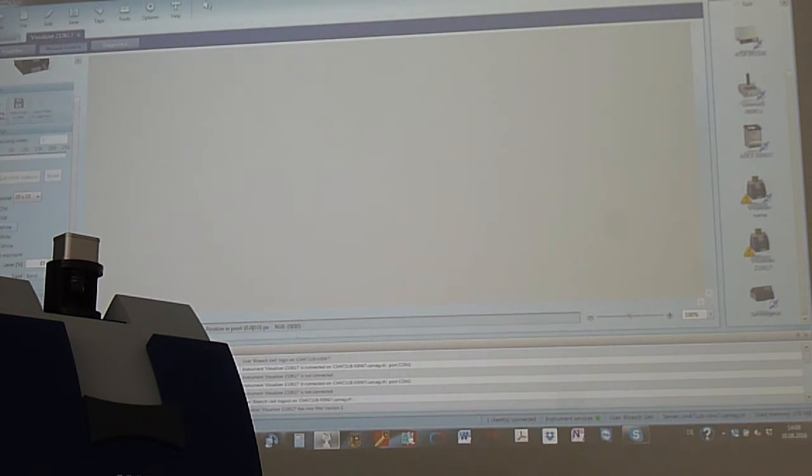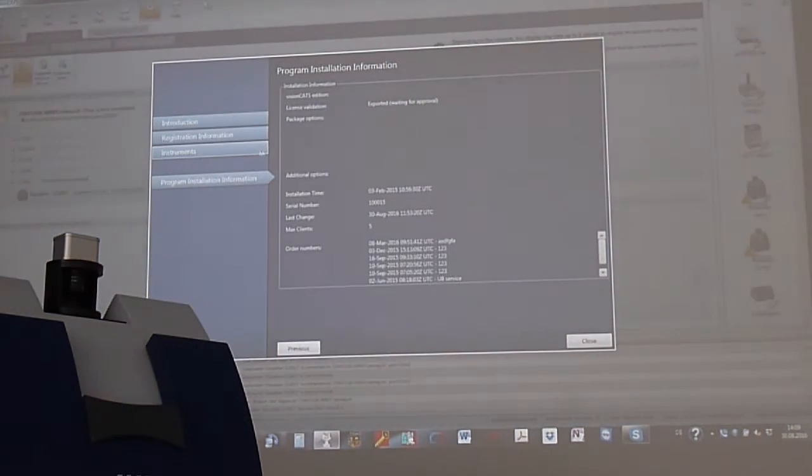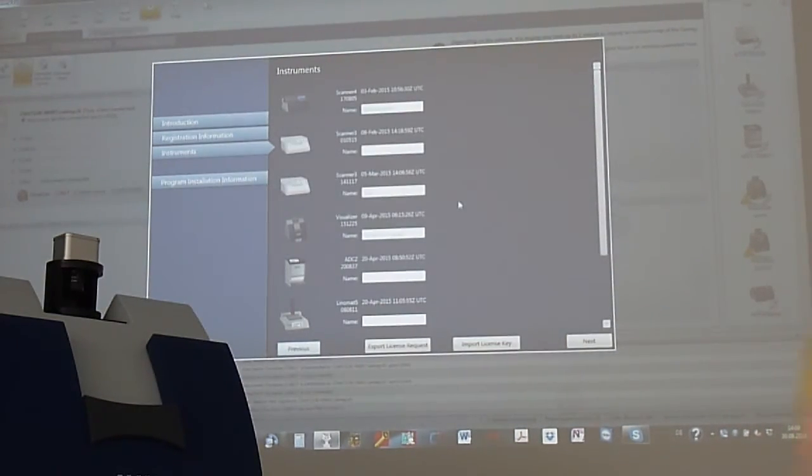Check if there's something here. Strange, it hangs up.